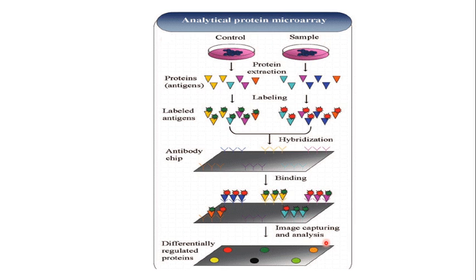If you talk about this orange one over here, you can see that the red fluorescent molecules are present, the green fluorescent molecules are present, but the number of red fluorescent molecules is high, or their fluorescence is high as compared to the green one. This means that when you apply a drug to this sample, the expression of this particular gene will be high, and the expression of this gene in normal condition will be low. So it is showing you a comparative expression of this protein.